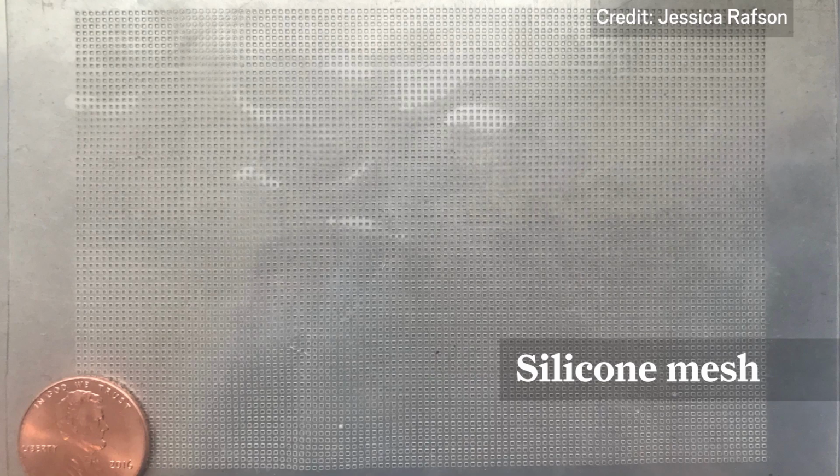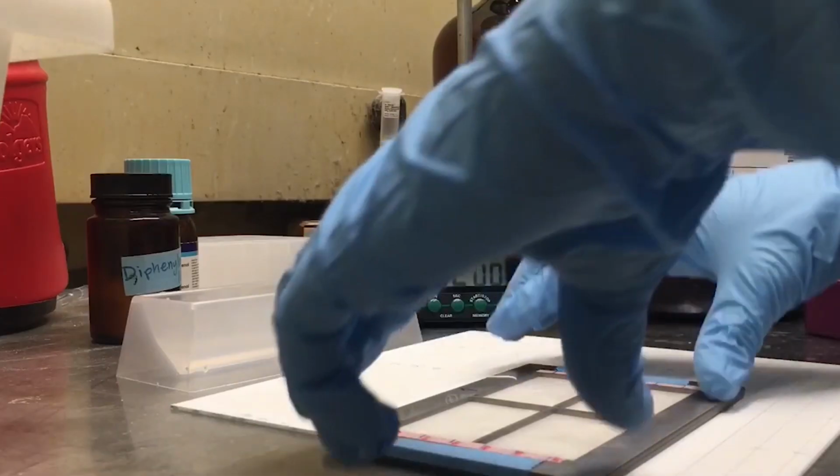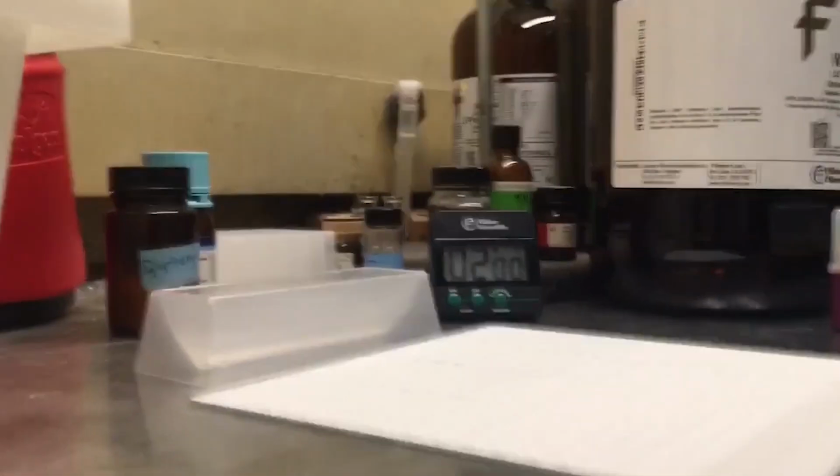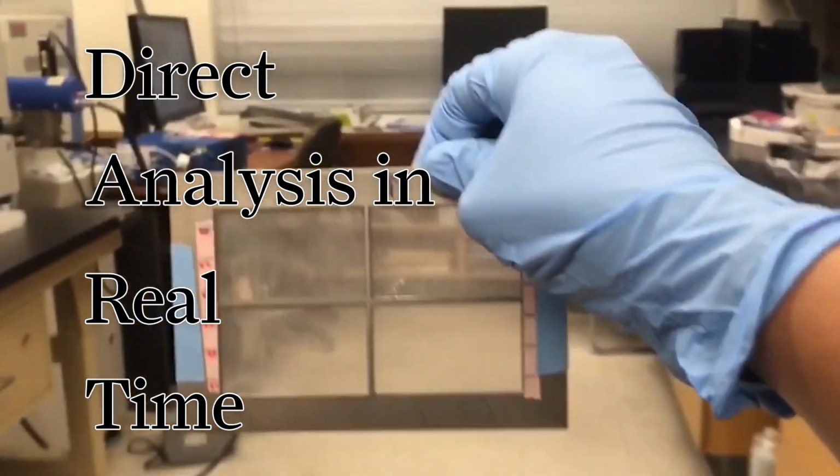Silicone can swell, which is like a sponge, to absorb a broad range of volatiles. It's not a terribly expensive material. You can buy silicone or its monomeric precursors very easily. After a couple minutes of letting that silicone sponge up odorants, they take it over to a direct analysis in real-time mass spec system, or DART-MS.